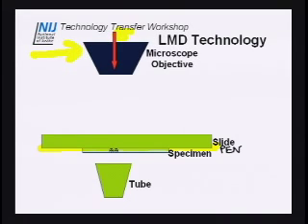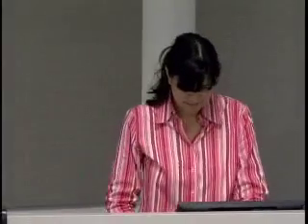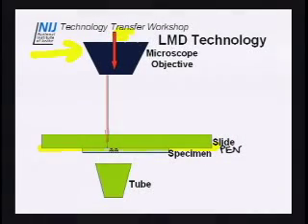You prepare your specimen on that slide, and then you stain it, or however you decide to prepare it. We'll talk about staining later. In this diagram there's an example of just a couple little dots. Let's say those are the cells. Underneath the stage is a tube, and you'll notice that the slide is upside down. So the laser will come through, cut around the sample, and then the sample will drop with the membrane into the tube. That's how you collect your sample.